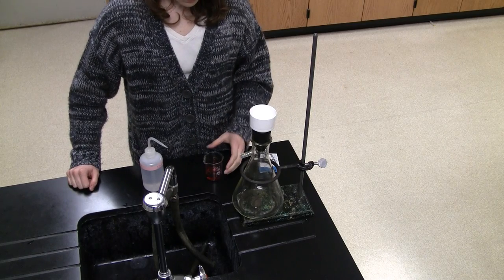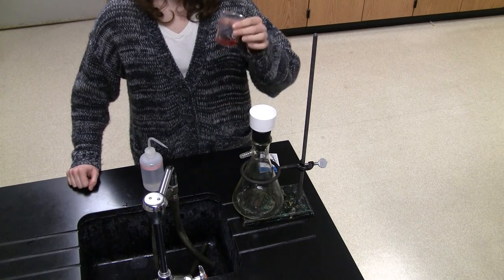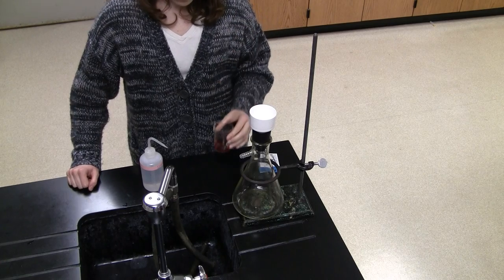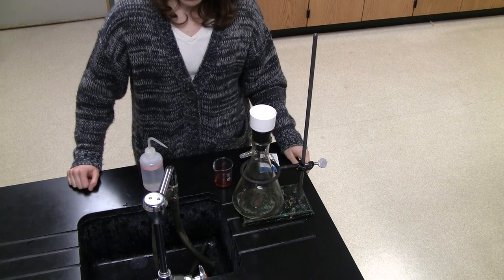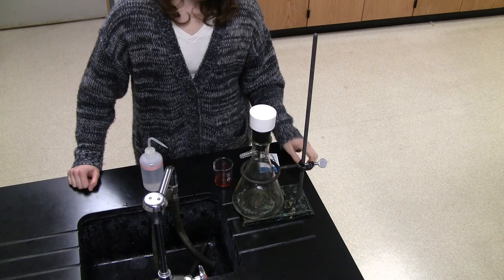A filtration flask and Buchner funnel are used to separate solids from liquids. You'll find these already set up for you near the sinks. To begin, make sure both the flask and funnel are empty and clean.